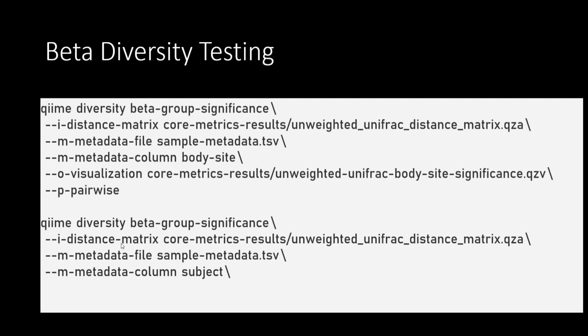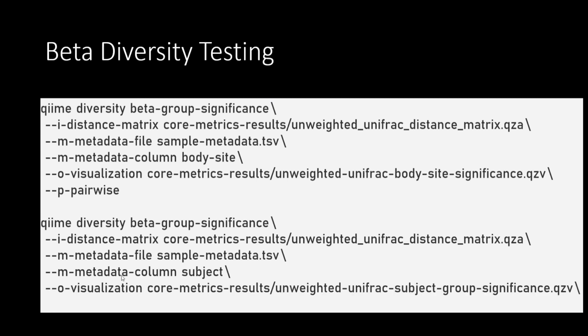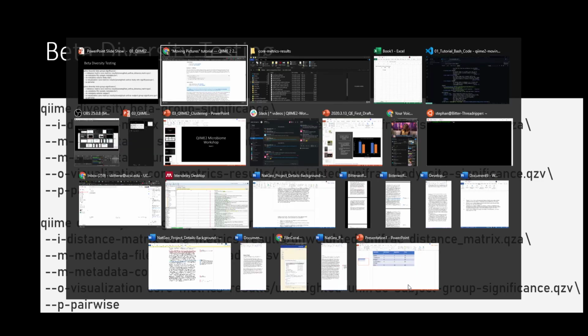And then we're going to do a sort of similar thing. In this case, we're going to be comparing the subject. All right, so body site before, subject this time, and we're going to call that this. So let's go ahead and look at this output.